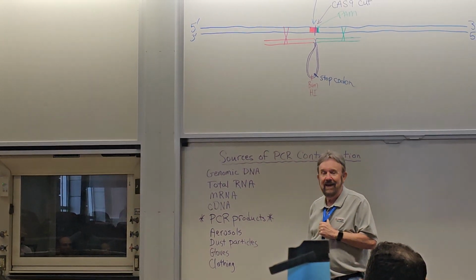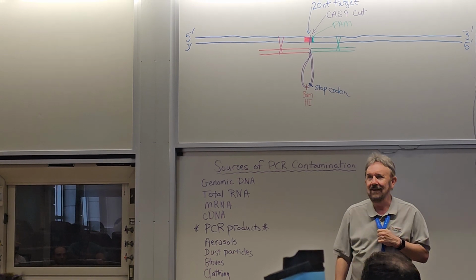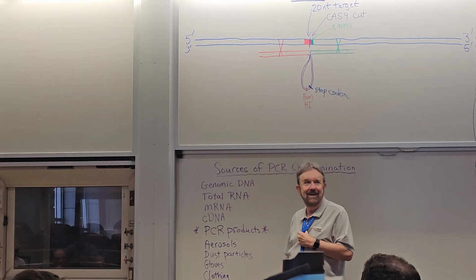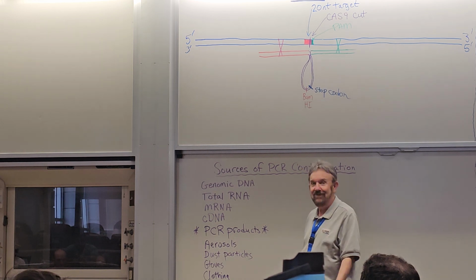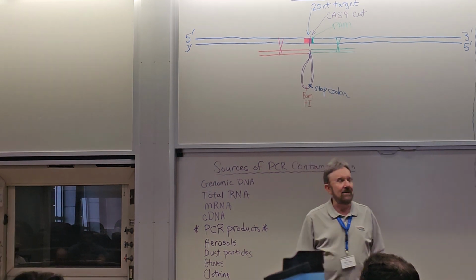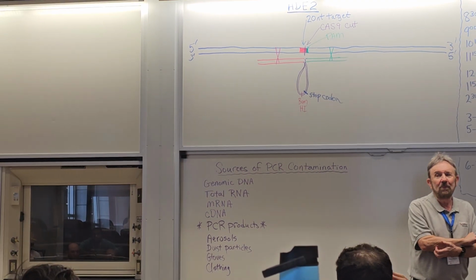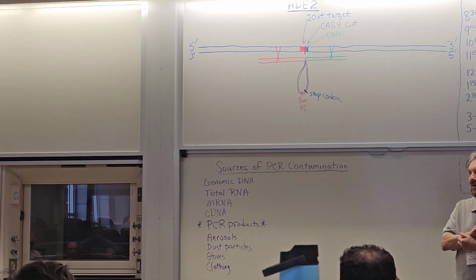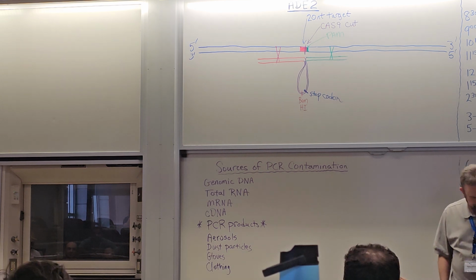It would mean that I have probably messenger RNA in the lab from mouse. I've probably made cDNA in the lab from mouse, just like we've done in this course, right? Worst of all, because I study TPR, I've probably done a lot of PCR on the TPR gene or on TPR mRNA looking at expression.